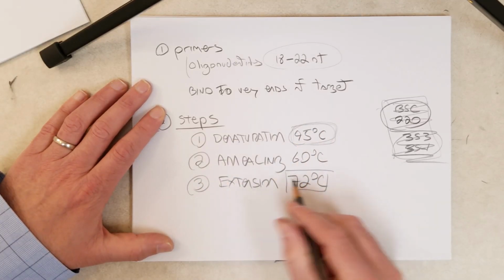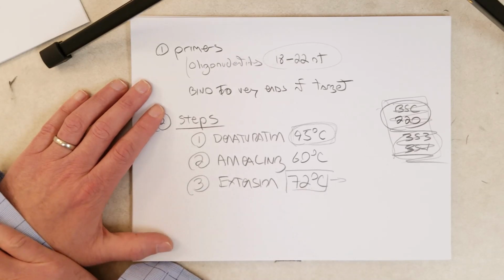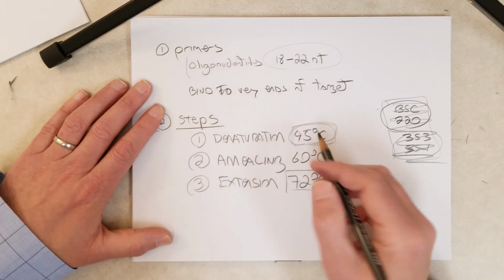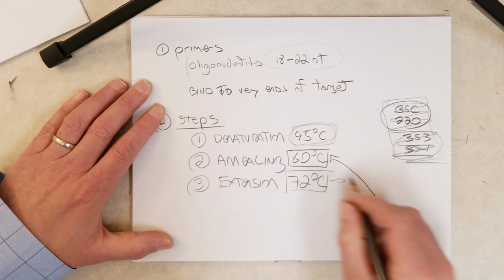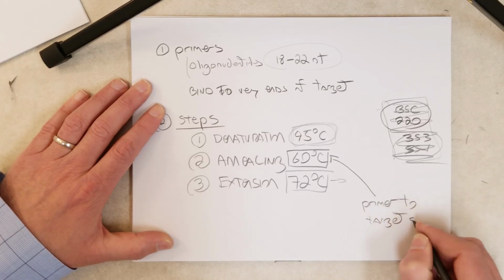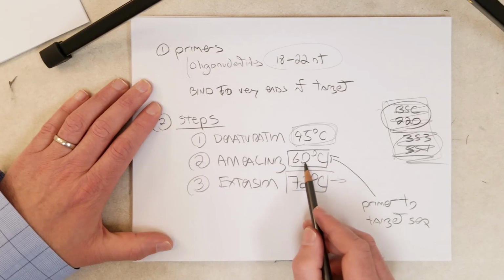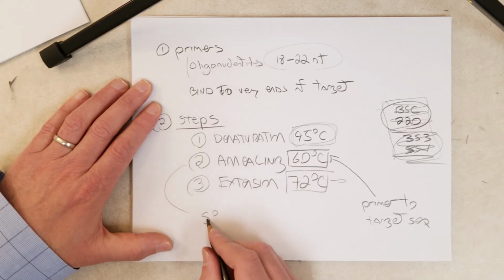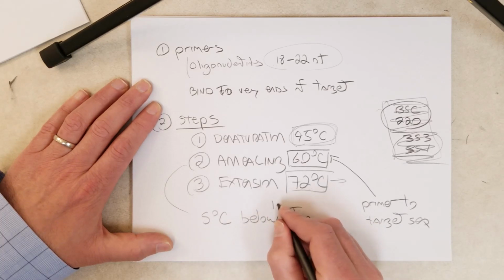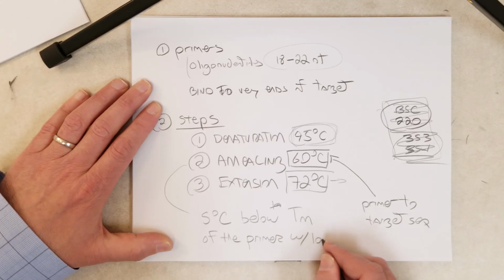Now 72 degrees, it turns out the polymerase that is used for PCR works best at 72 degrees Celsius. So that's why we use this temperature here. That's the temperature the enzyme works most efficiently at. Now this one right here is chosen as the temperature to promote annealing of the primer to the target sequence. And the temperature often changes from one reaction to another. A rule of thumb is the temperature should be 5 degrees Celsius below the TM of the primer, forward or reverse, with the lowest TM.